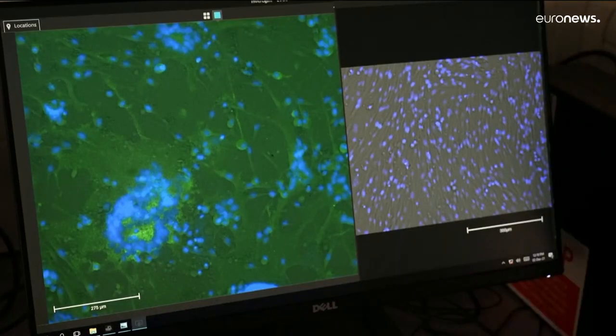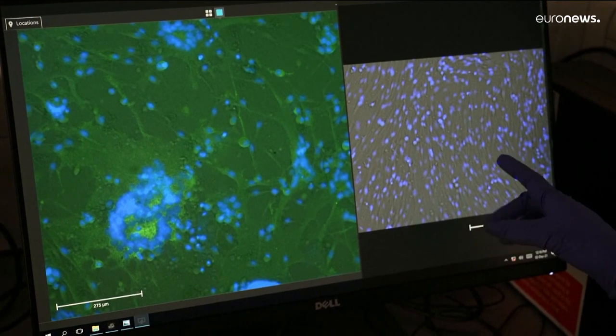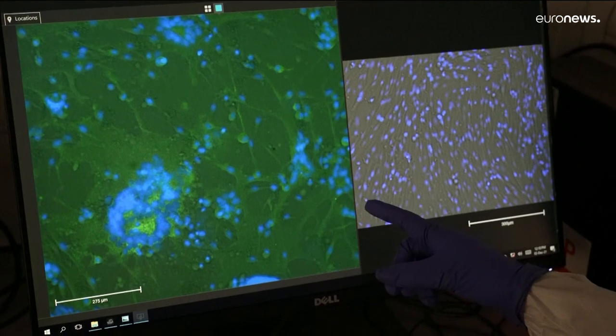On the right we have cells that are uninfected and healthy, and on the left we have cells that we've infected with SARS-CoV-2.